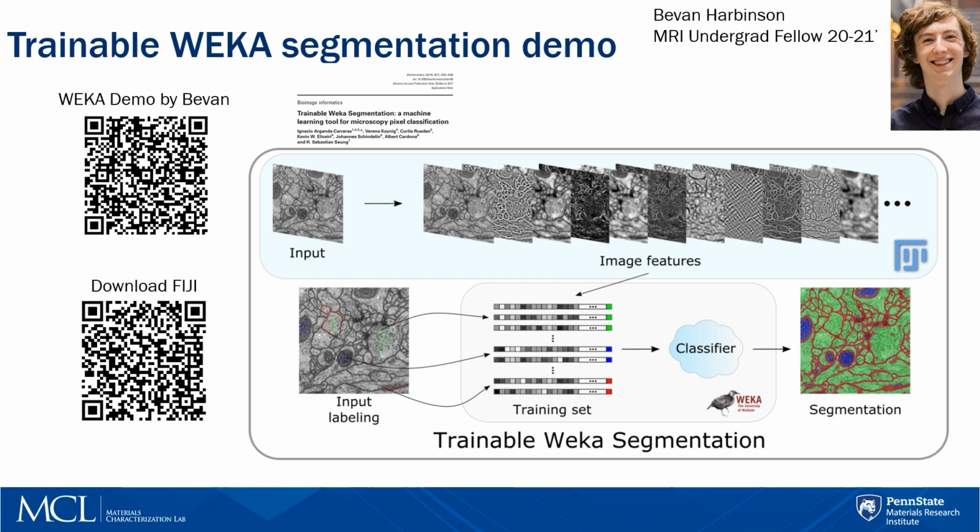And he used this initially as a tool to help with particle size analysis of microplastics, but then he built a video catalog for us referencing particular applications of WEKA. And here I have a QR code that links you to one of the videos that he's previously recorded on how to use WEKA inside of FIJI.